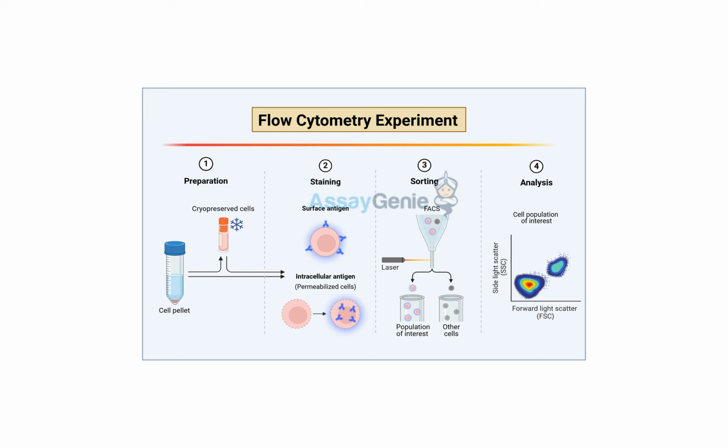So the article also talks about some of the advanced applications of ICFC, some really cool stuff like intracellular cytokine staining and phosphoprotein analysis. Those sound pretty intense. Powerful techniques. Okay, so let's break them down a bit. Let's start with cytokines. So cytokines are like the messengers of the cell, right? Exactly. They help cells communicate. They're essential for so many processes, like immune responses, inflammation, cell growth, development. It's all about communication.